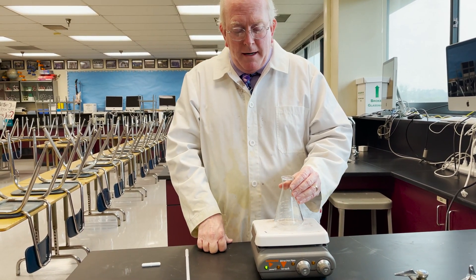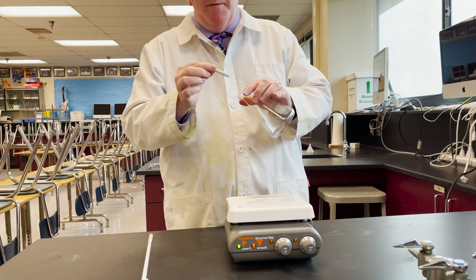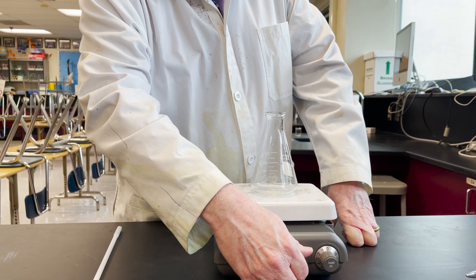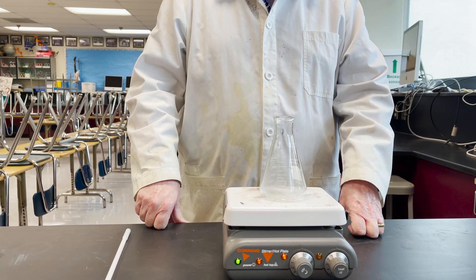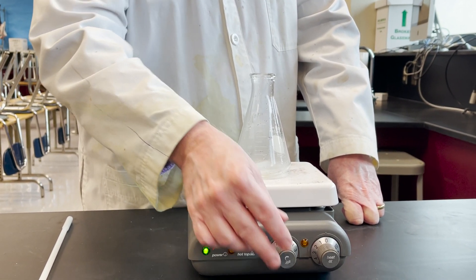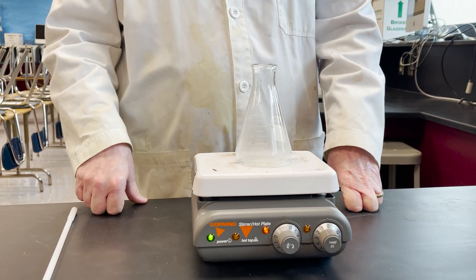I'm going to take this Erlenmeyer flask and put it on top there, and I'm going to add in this magnet — this little stir bar. Drop it in like that, put it there. And when we turn on the stir feature, you will see that it starts to spin. We have a range of settings — we can slow it down for a very slow stir, we can speed it up, and we can theoretically heat at the same time.